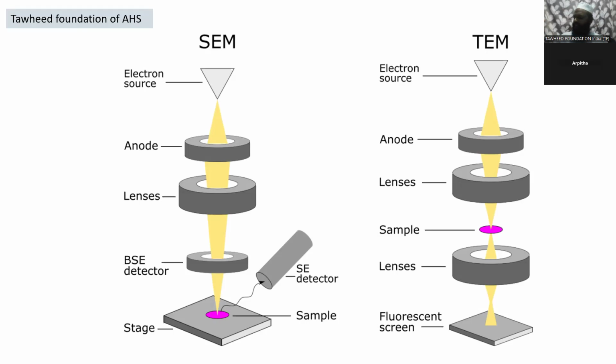Coming to the transmission electron microscope, this transmission electron microscope is used to view thin specimens through which electrons can pass, generating a projection image. The transmission electron microscope is analogous in many ways to the conventional compound microscope. It is used, among other things, to image the interior of cells.